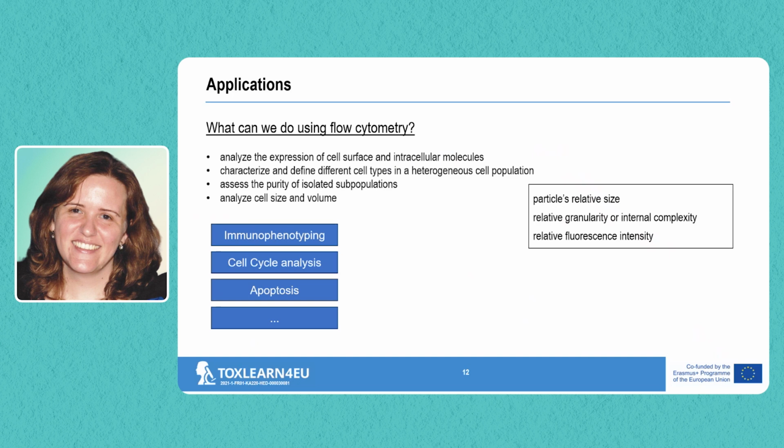Of course, to use it for all these techniques, there is another concept that I haven't talked about yet, and it's the use of antibodies. In order to identify these populations, as I was showing you in the previous graphs, we can use forward scatter and side scatter, but sometimes that's just not enough. There are some cell populations that have two similar sizes or two similar complexities, and they will still be overlapping in those graphs. So we need to distinguish them using fluorescence.